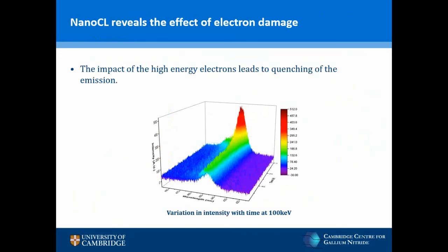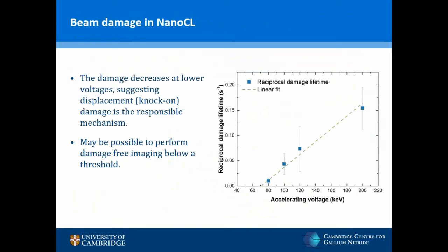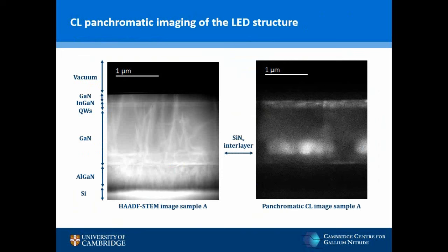When we first began performing STEM-CL, one of the challenges was quenching of the emission with exposure to the electron probe. Beam damage is well reported in the nitrides; however, the CL intensity declines immediately with time, as shown at 100 kV. To understand the damage mechanism, we measured the decay half-life in CL intensity over accelerating voltages ranging from 80 to 200 kV, and found that damage is substantially reduced at lower accelerating voltages, suggesting that displacement or knock-on damage is responsible. The linear reduction in damage suggests it may be completely suppressed, and we tentatively suggest there may be a threshold below which it is possible to perform pristine, damage-free nanocathodoluminescence imaging.